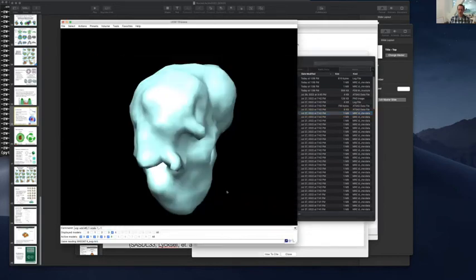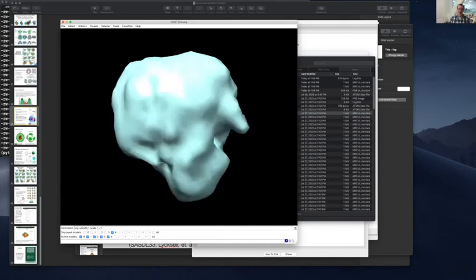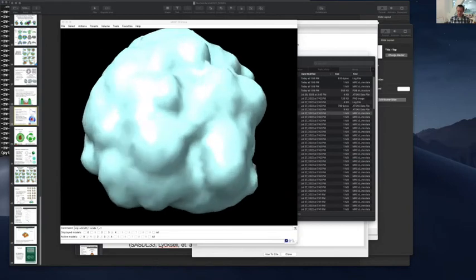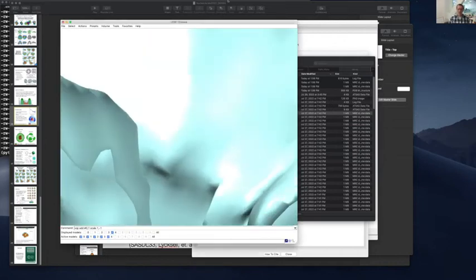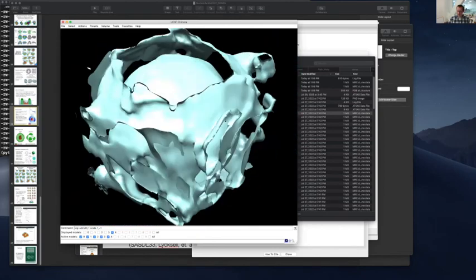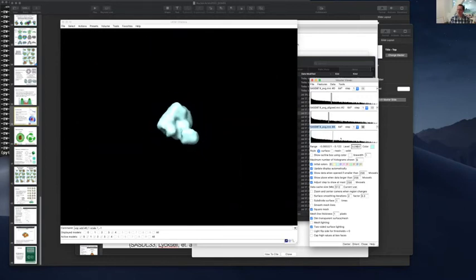Okay, so if I load that into Chimera here, it looks like this. Yours might be gray or something, but it looks like this. Now, one thing to note is sometimes when you do this, it'll look something crazy like this, right? If you run DENS and you get something that looks like this, it just means that in your volume viewer, the threshold that it shows was way, way too low, and it's just showing noise. So just grab it and move it up even a tiny bit, and it'll start to change the density value, okay?